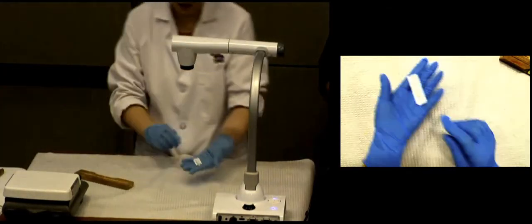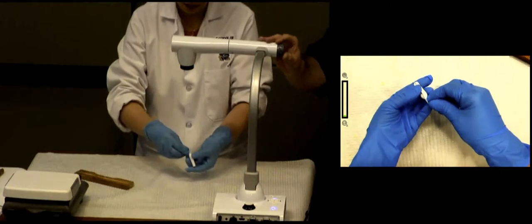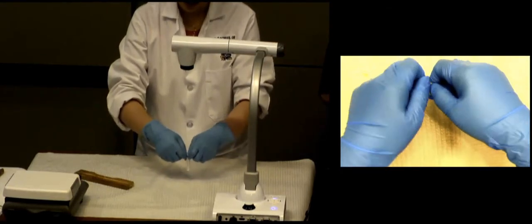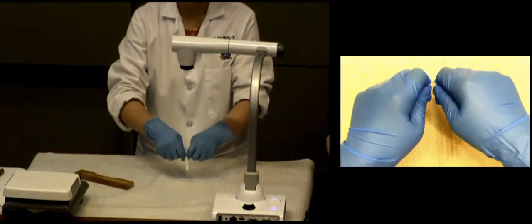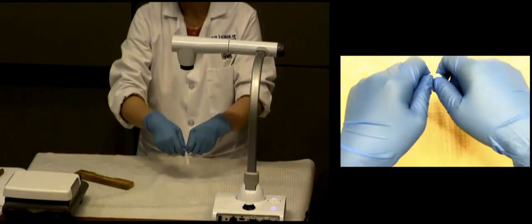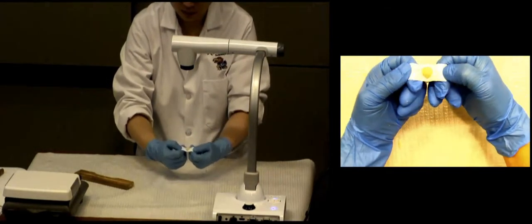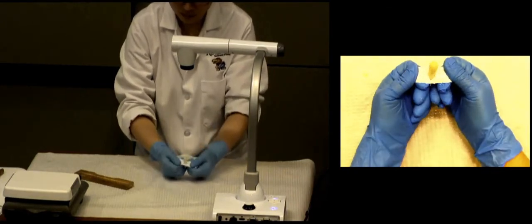So that's one of the suppository. Okay, I'm going to open from the bottom. And pulling them apart doesn't take that much skill, but you need to make sure that both hands pull with an equal amount of force, because otherwise you don't want to create any chip or divots at this point, because this is your final product. Suppositories are relatively soft and malleable. If you take your finger and push on it, you will dent it or deform it as you're trying to unmold it.